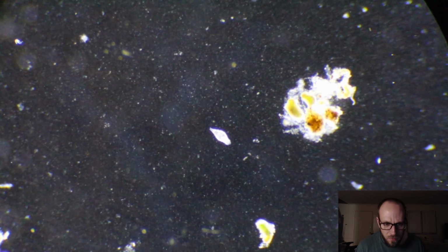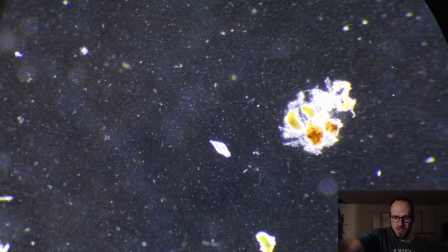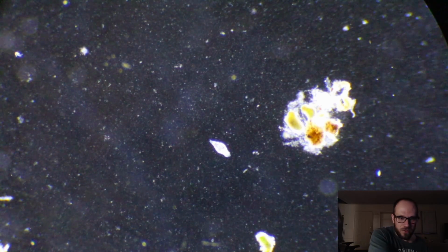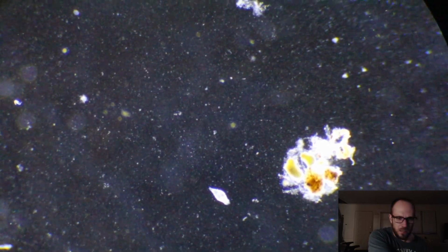Well, that's the first dead rotifer I've ever found. Almost makes me want to sanitize my hands again. Yeah, you drink that water, it's going to make you poop. But yeah, we see our little swimmy guys. Fascinating. So yeah.